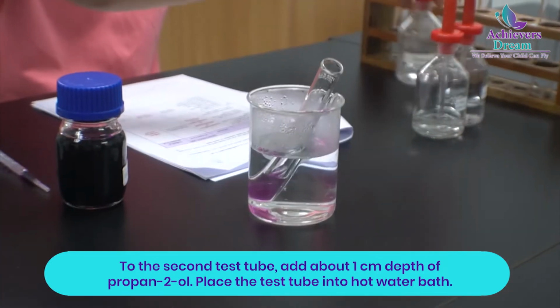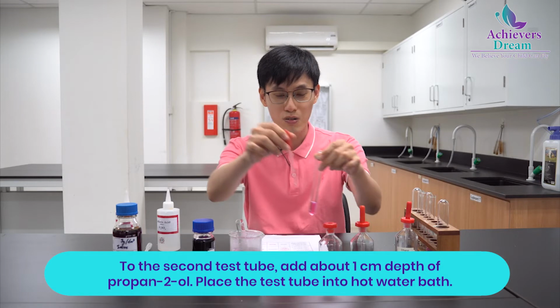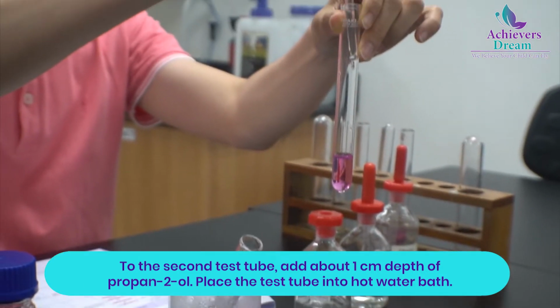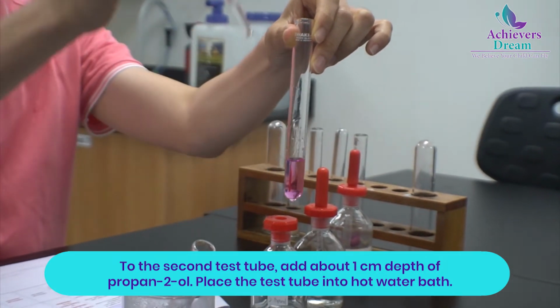Next, let's do that for the second alcohol, which is propan-2-ol. This is a secondary alcohol. We expect to see decolorization of the KMnO4 too.